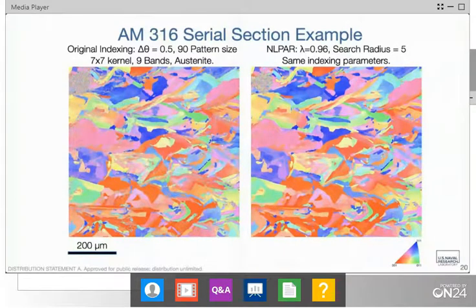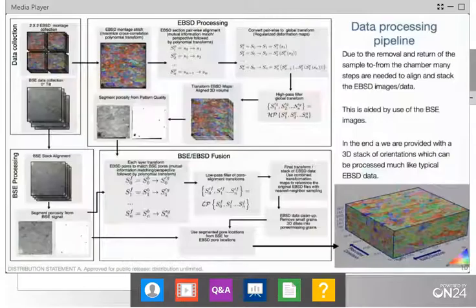But what I want to say is that the way that we had set up this original pipeline of all of these different transformations is that we are saving not the transformed images, but the list of transformations. So it ends up being this very long list of exactly what transformations go into making up your data. The final reconstruction is actually going back through that whole chain of transformations and referencing the original data just one time. So we're only doing one resampling, and that really greatly eases things.